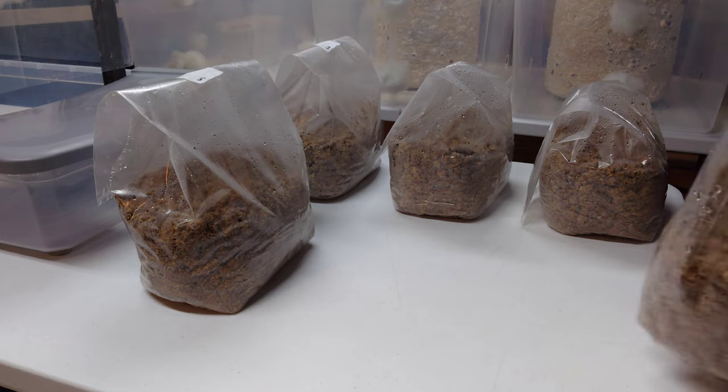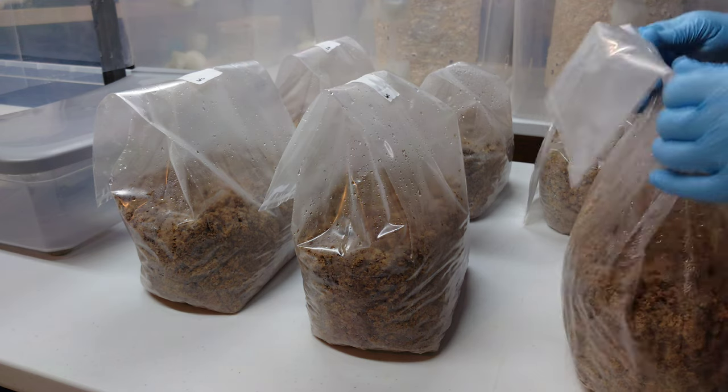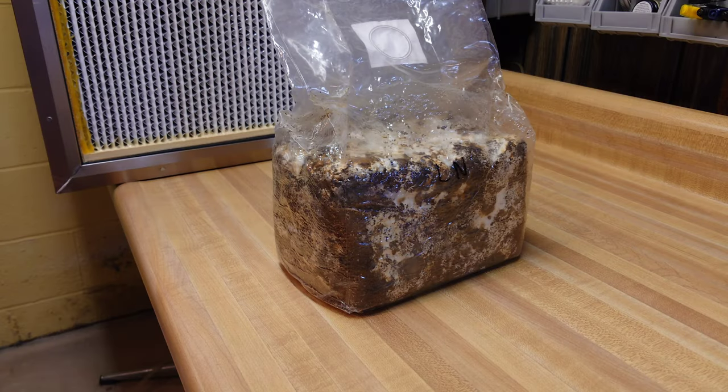After the timer goes off, the next step is to cool these bags down to room temperature. We're back down in the basement — I'm just spacing them out on the table. It's very important to never inoculate hot substrate because it's just going to kill your spawn. Once our bags are fully cool, we are ready to inoculate them with our store-bought spawn.